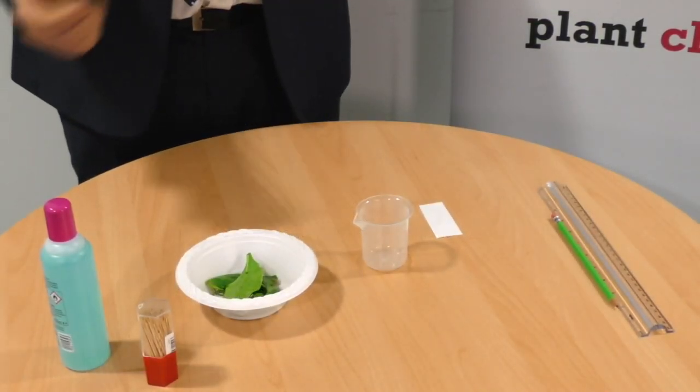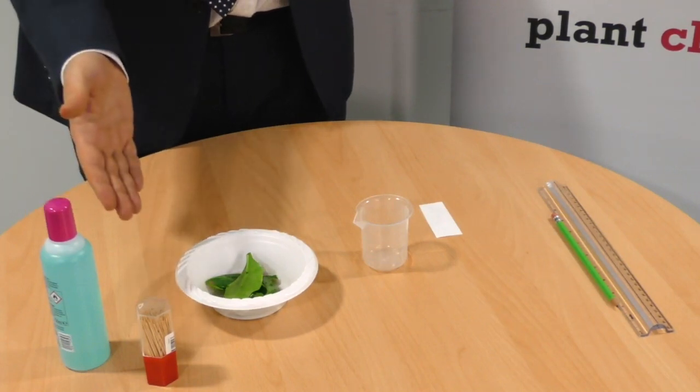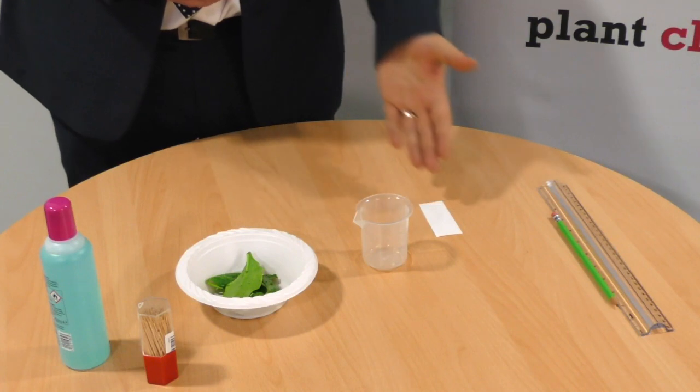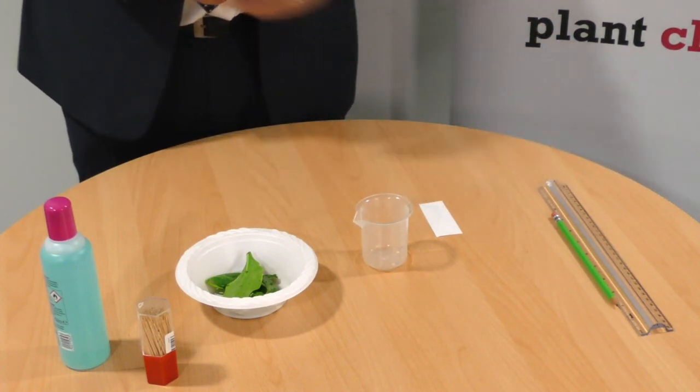For this experiment you will need some acetone or nail polish remover, some cocktail sticks, some spinach or coriander leaves, a beaker, a length of filter paper, a pencil and a ruler.